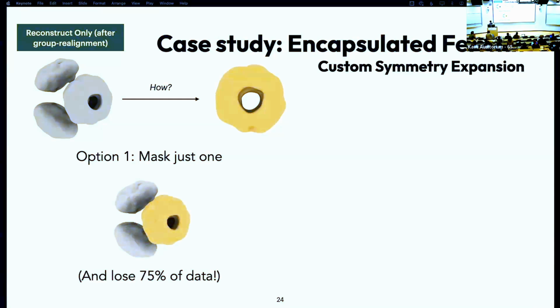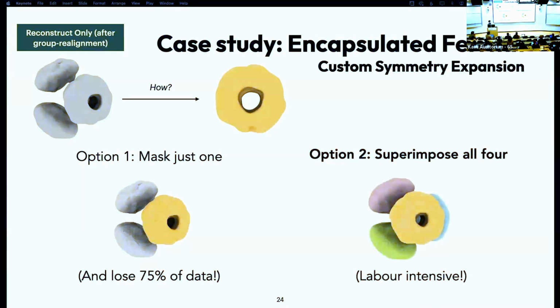So in this case, the better option, what we'd like to do, is to use CryoSPARC to somehow superimpose these 4 copies of the encapsulated ferritin so that they can be combined into one structure for a final refinement. A priori, it's expected that each of these 4 units is identical or indistinguishable. And at least at the scale we're working at now, we don't even have reason to believe that if they weren't, we had somehow meaningfully separated them yet. So in this case, I felt like this would be a sensible step to do.